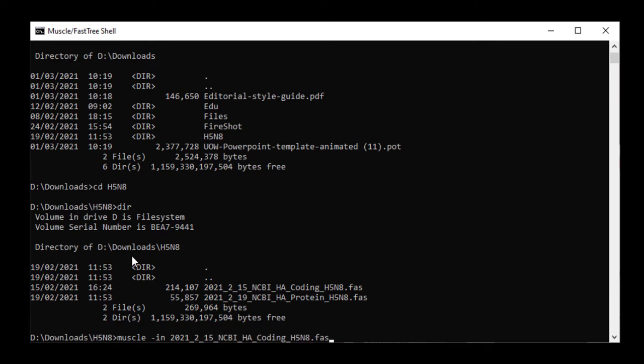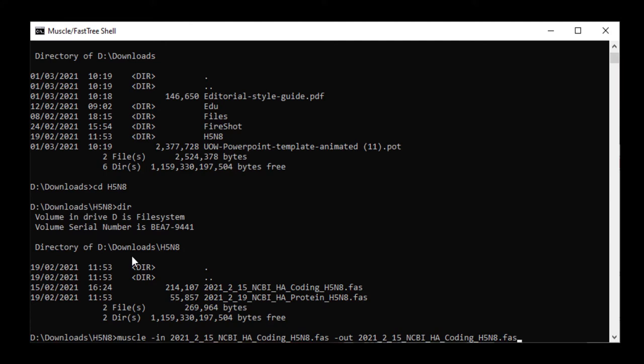This happened because I pressed the tab key, which gives you automatic name completion to either a unique file name or the name of the first file that starts with those letters or numbers. As there are two files here with dates, once I type 2021_2_15, I can use the tab key to complete the file name because that's unique.